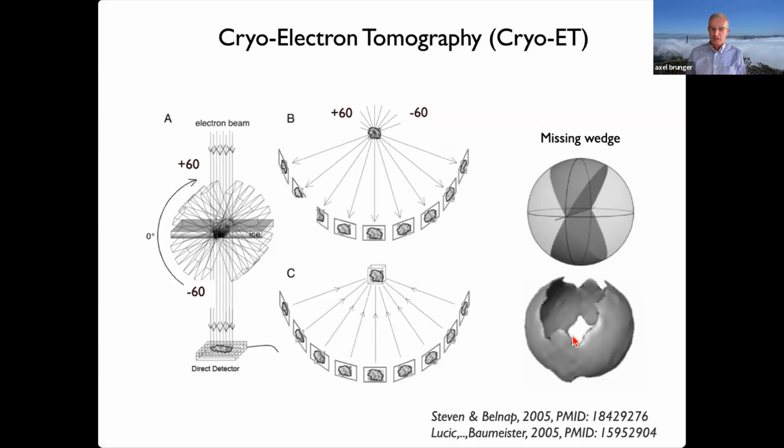And of course, if you lower the contour level, you eventually see a connection, but it will be very distorted and anisotropic. So this is clearly the limitation of looking at single tomograms. And of course, subtomogram averaging is a method to alleviate that and also increase the resolution.